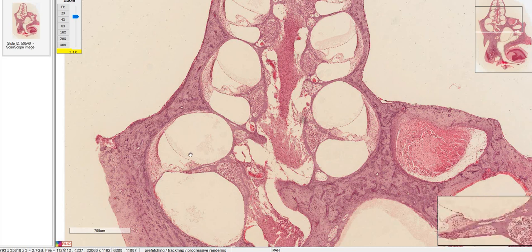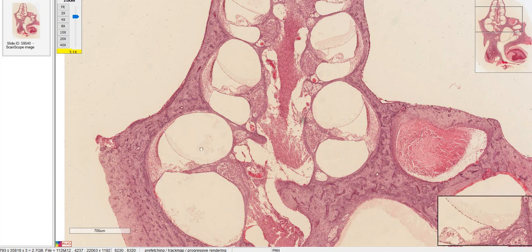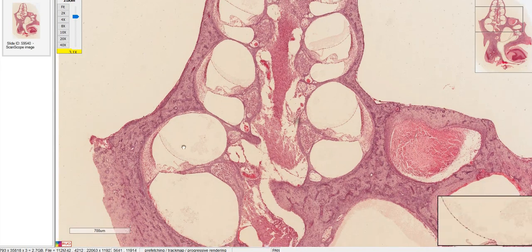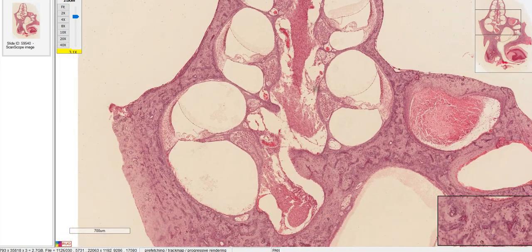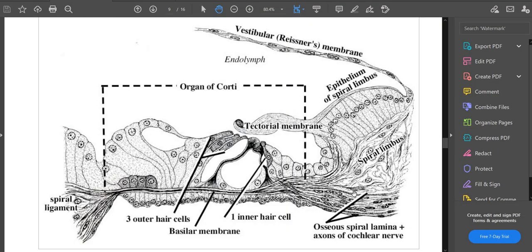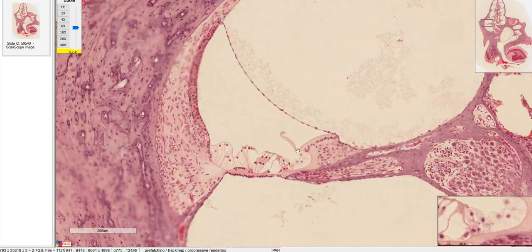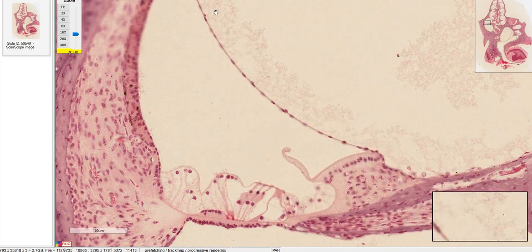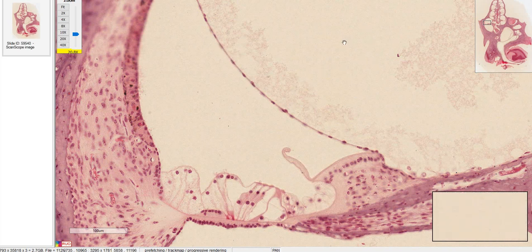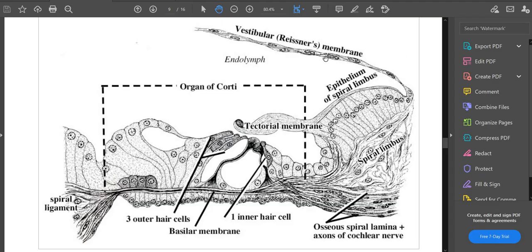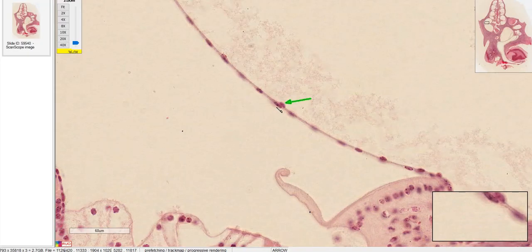Now we're going to look at one of these cochlear cross sections in more detail. The lab manual recommends one, but I like the larger one on the bottom left because it most closely resembles the reference diagram. The first thing I want to look at is Reissner's membrane, which separates the scala vestibuli from the scala media. You can see from this picture that it's a very thin membrane, but it does have epithelial cells on either side.